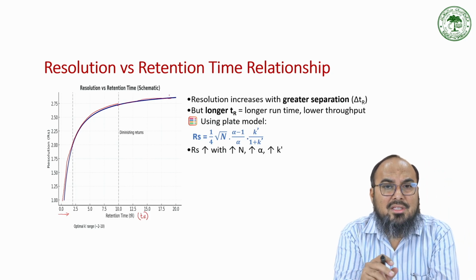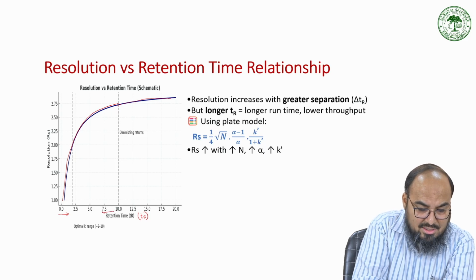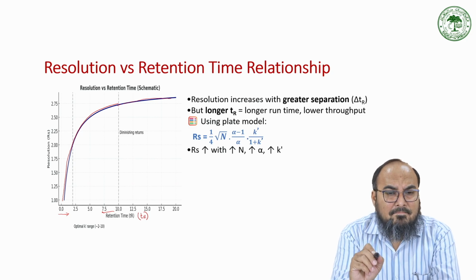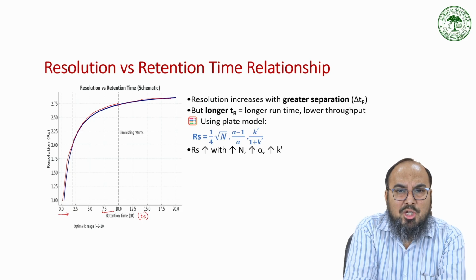It does not increase as much as it increased before the 10 minutes of time. So the resolution increases with the retention time.